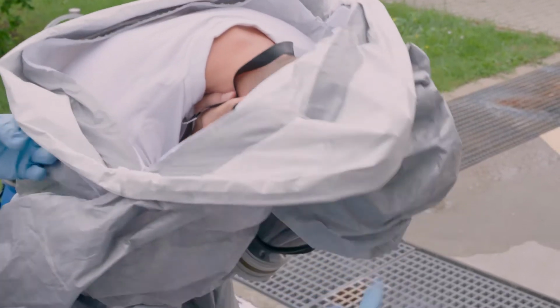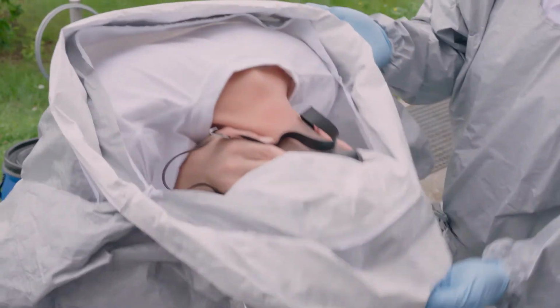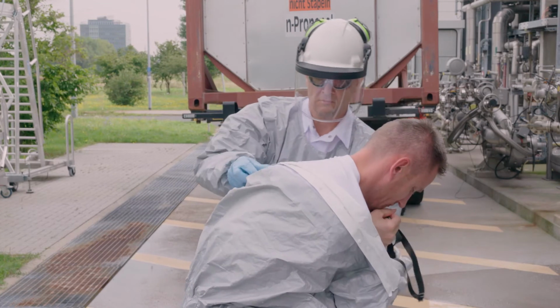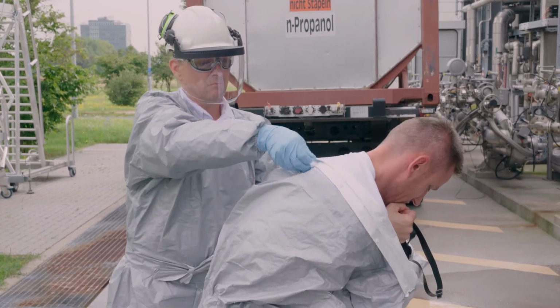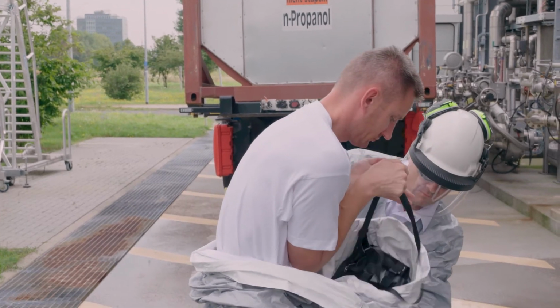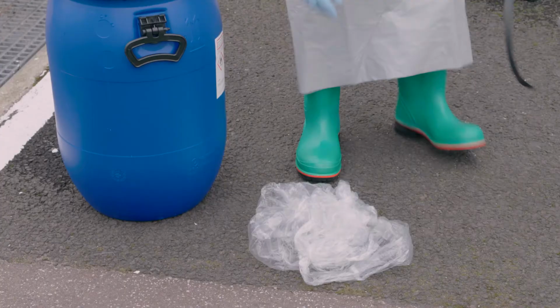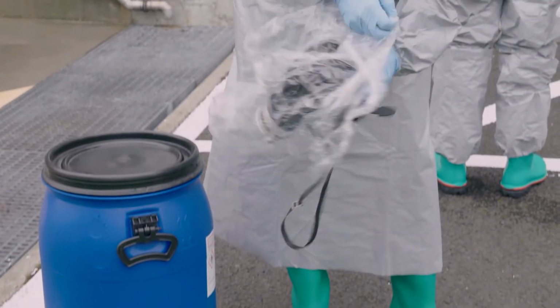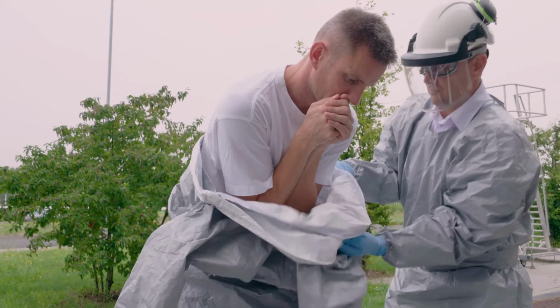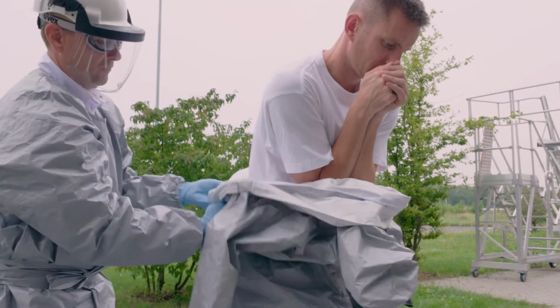Bend forward. Then pull the hood forward and take it off, together with the mask. You may also keep the mask on and take it off at the end. Wrap the mask into the appropriate packaging to be sent for cleaning. Roll the garment downwards to knee height, again keeping the interior outward.